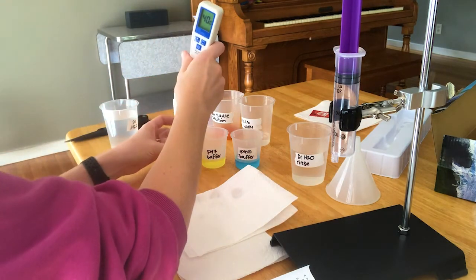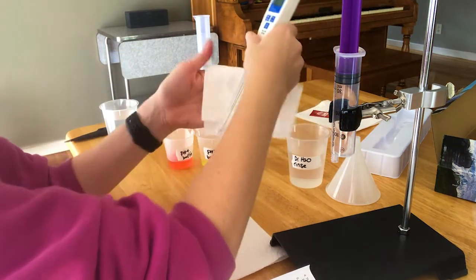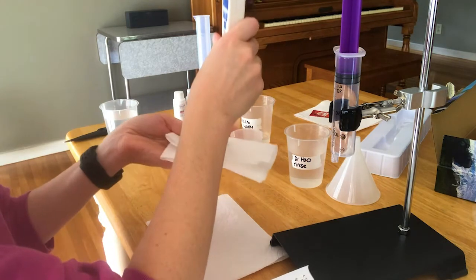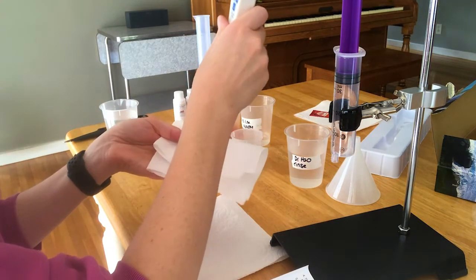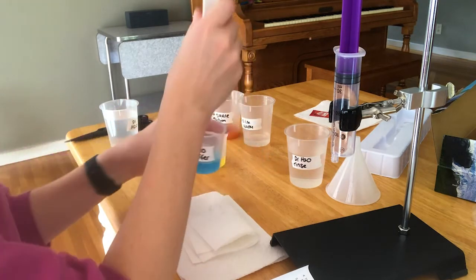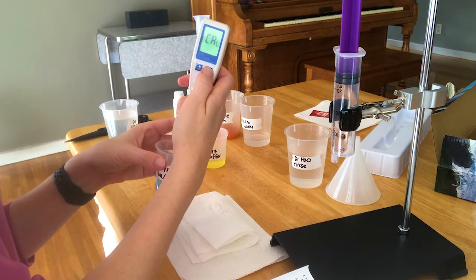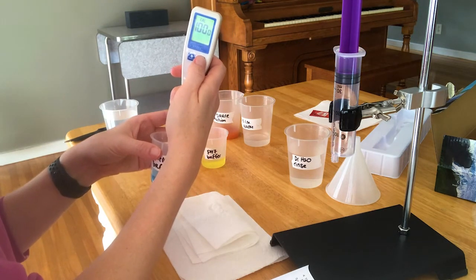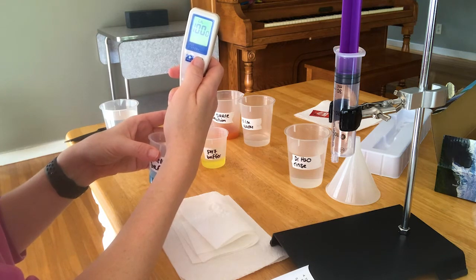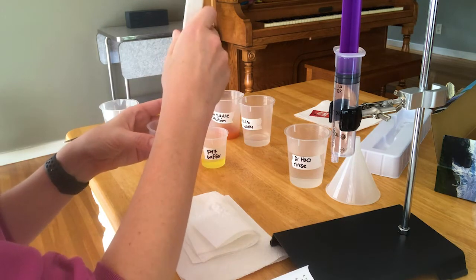It's not ideal to be dipping it in this same container of distilled water each time because I could be contaminating it, but I'm assuming there's not a lot of liquid on the electrode that I'm rinsing off. It's much better if we had a wash bottle to rinse it. Then repeat everything with the last buffer — press calibrate, and it's going to automatically say 10. You don't have to hold down the calibration button, and then we're ready to go.